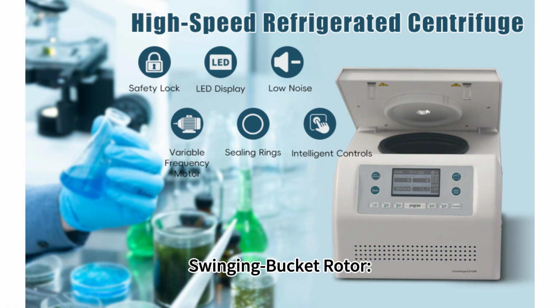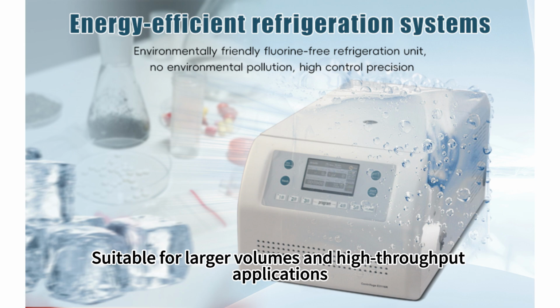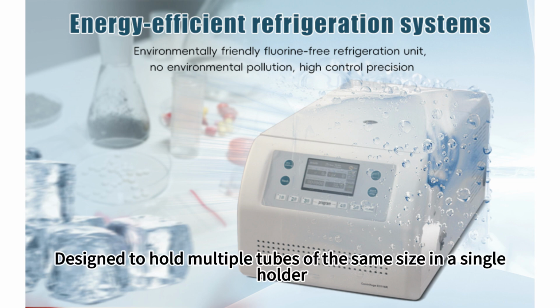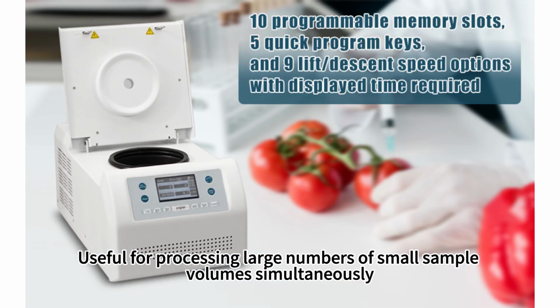Swinging bucket rotor. Description: buckets swing out as the rotor spins, allowing samples to face outward. Suitability: suitable for larger volumes and high-throughput applications. Multi-tube rotor. Description: designed to hold multiple tubes of the same size in a single holder. Suitability: useful for processing large numbers of small sample volumes simultaneously.